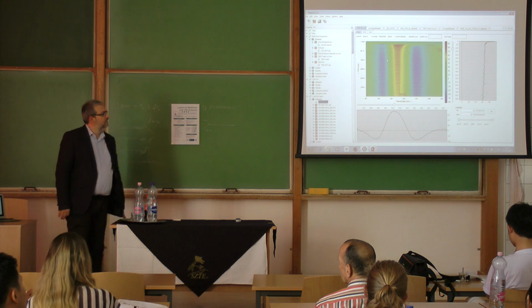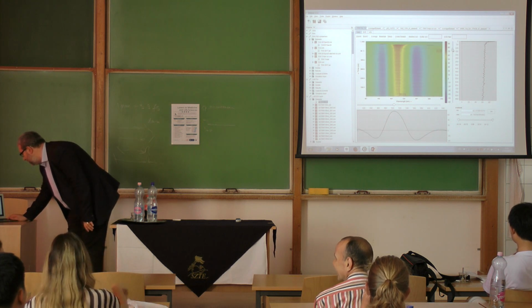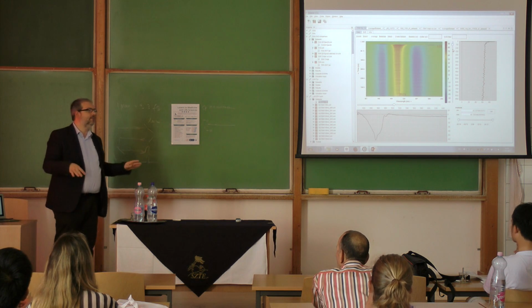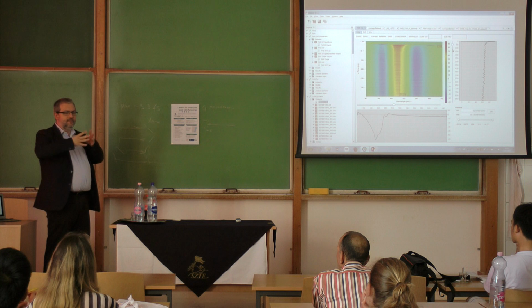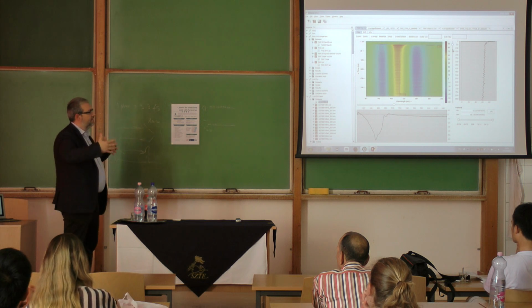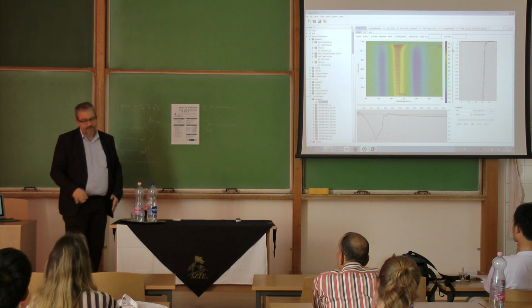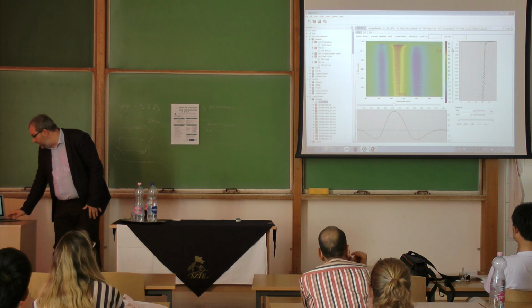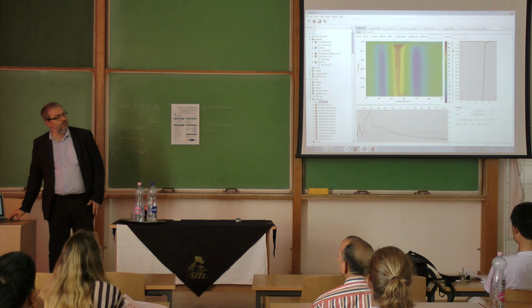Actually, this is what I showed you here again because it's quite cool: you can see how your light is propagating. It's a huge story how to compensate for this dispersion, because your pulse is dispersed in frequencies. Your red part of the beam arrives earlier, as you can see, and the blue arrives later. Sometimes you want to compress it to make a shorter pulse. This is how we know that this is time zero.